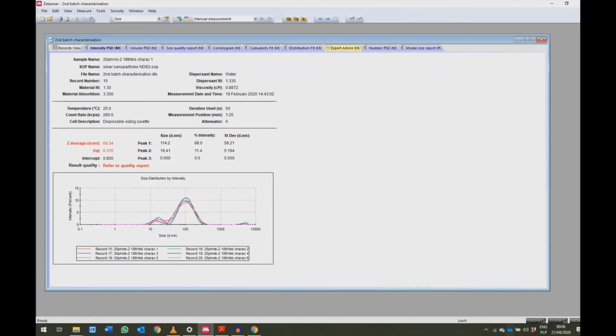It gives you a little bit more information if you wanted to change into volume and number, but I wouldn't be worried about it too much at this stage, because volume and number gets extremely difficult very quickly, because you have to understand the maths that is behind it as well, and the calculations and the limitations that it comes with. So if you do get into theory and you start investigating and you find that you want to use that, let me know. I'll be more than happy to explain more about the volume and the number.